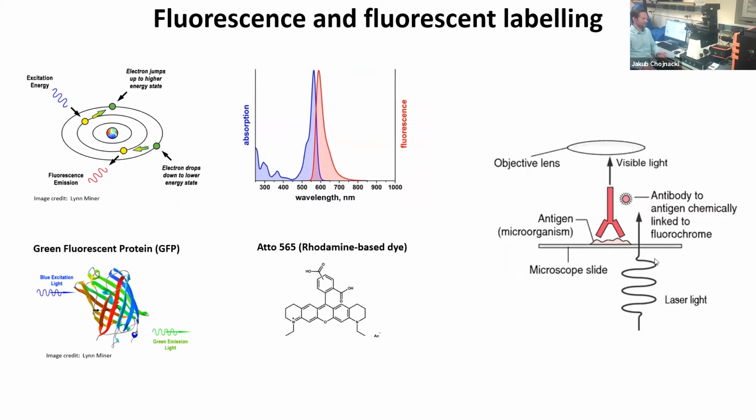So generally, when we want to stain a sample for fluorescence microscopy, we have antibodies which are specific to the structures that we want to study, and those antibodies also have a fluorescent molecule attached to another end. By utilizing the specificity of antibodies, we can target structures of interest in viruses, cells, tissues, all the way to complex samples.